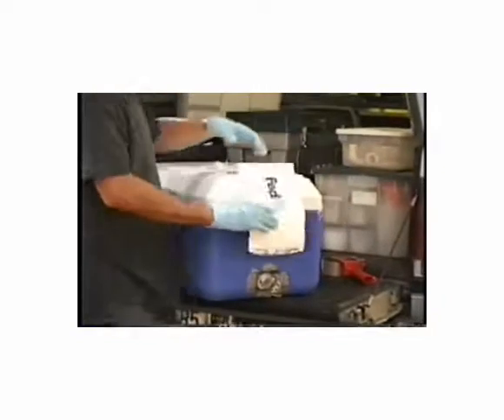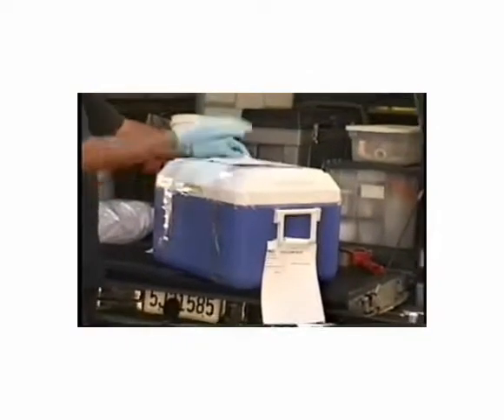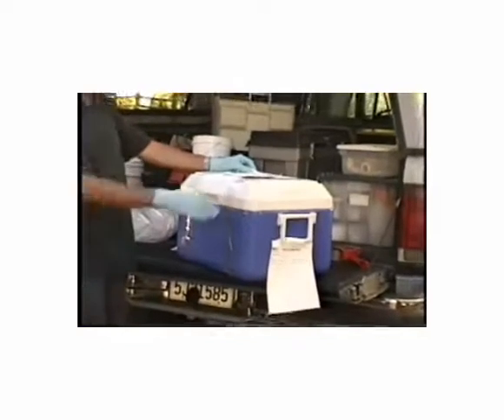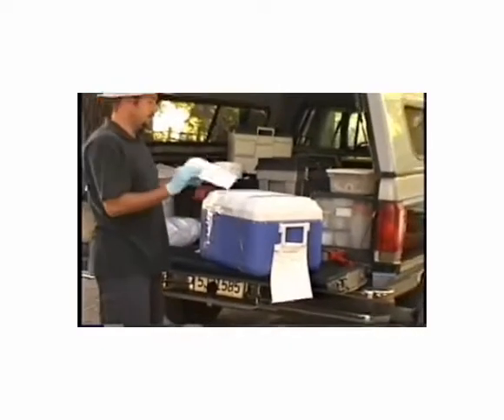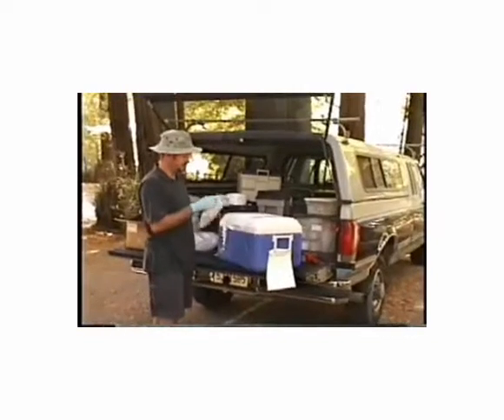A lot of times if you stick the shipping label on top of the cooler, the coolers get stacked and the shipping label is going to get ripped off in the shipping process. Therefore, the cooler is unknown of where to go.